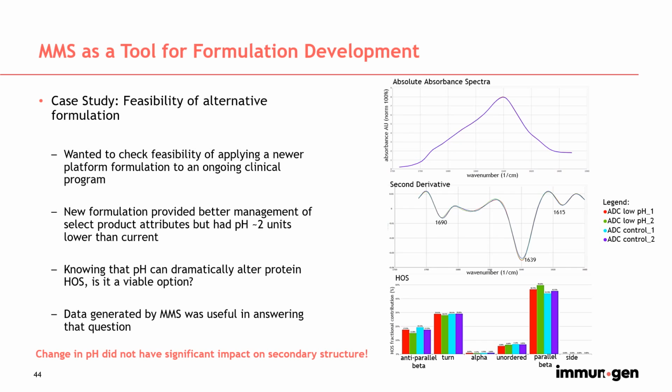Although in this case just one formulation condition was looked at for screening, considering that MMS does have an automated workflow capacity, we could see how this could be easily used for early on formulation development and screening studies, where there are a large number of screening candidates and conditions that formulation scientists need to look at for effective formulation development.